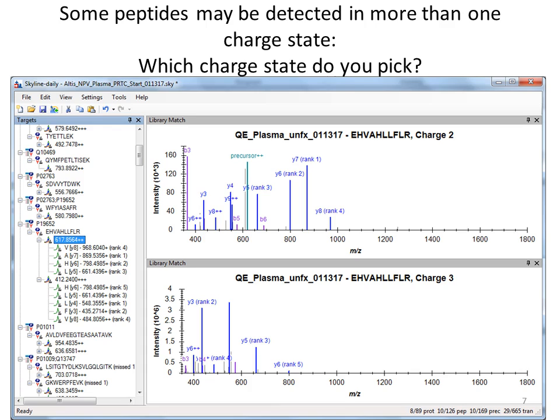And then any fragment ion that contains that modification will have that added mass to it. So for isotopically labeled things, that's great because they stay in the amino acid. They're not technically a side chain, an additional modification.